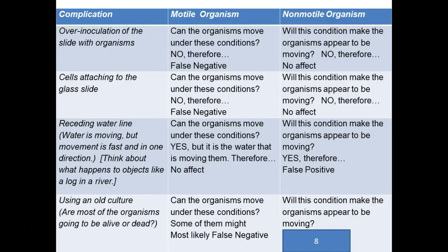You want fresh cultures. A non-motile organism. Is this going to affect your results? No, right? Because dead ones don't move. We're not talking about walking dead bacteria, right? No zombie bacteria. They don't move when they're dead. So this wouldn't have any effect.